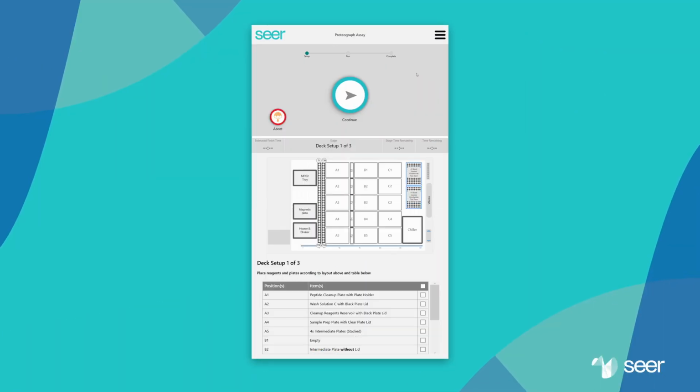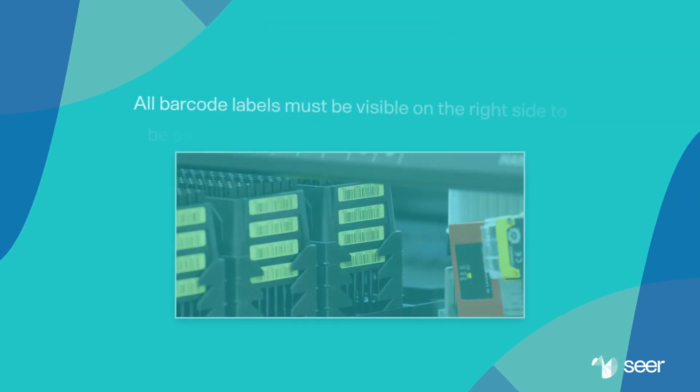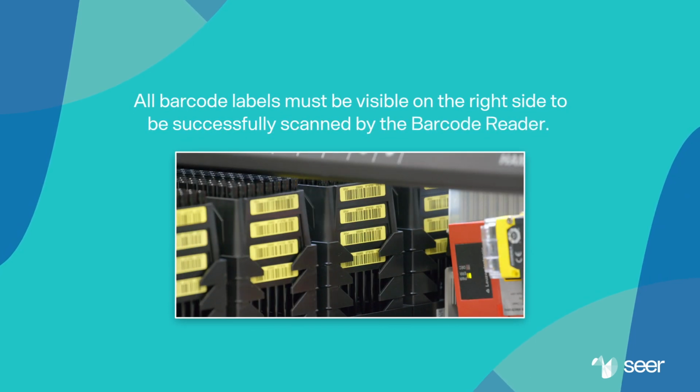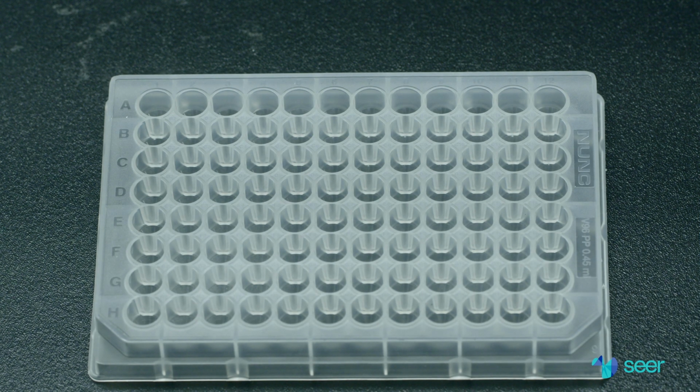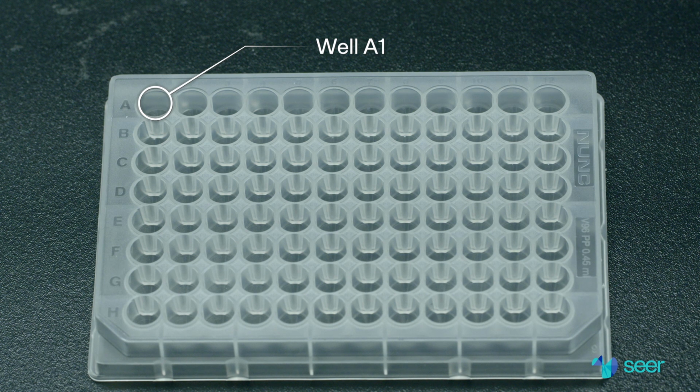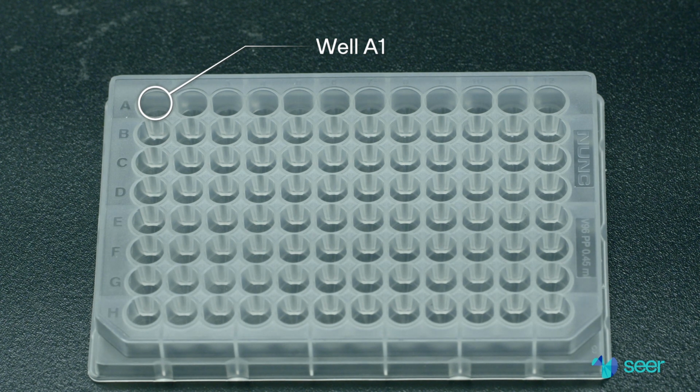Follow the prompts on the ICS to set up the SP100 work deck. All barcode labels must be visible on the right side to be successfully scanned by the barcode reader. When loading all plates, ensure that well A1 is located in the top left corner. First, we will load the plasticware. Follow the prompts on the ICS.